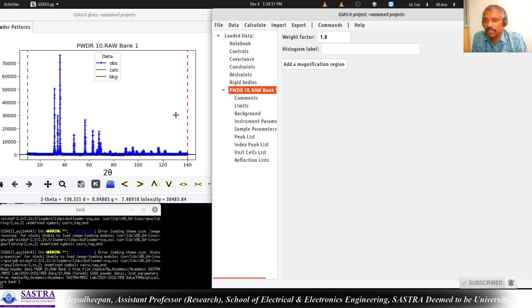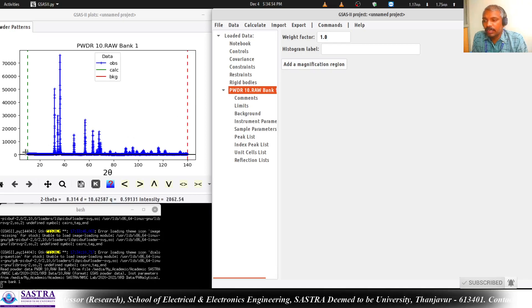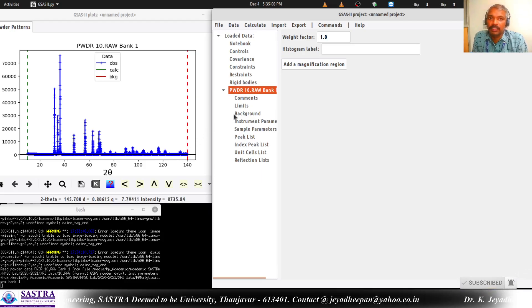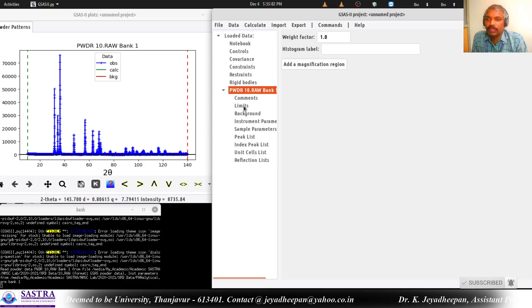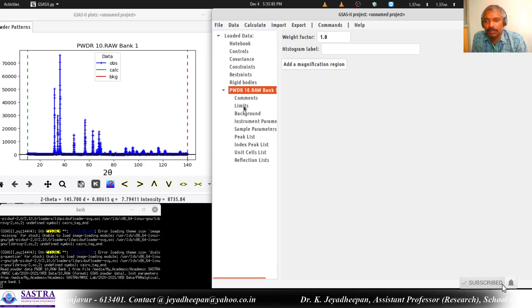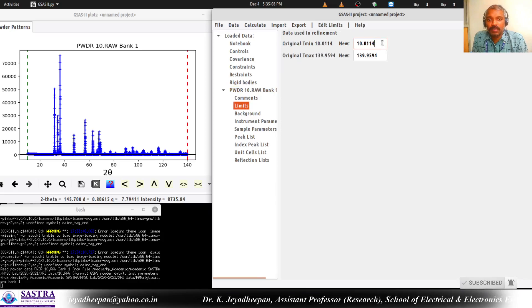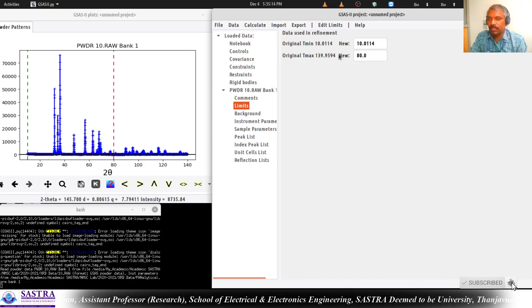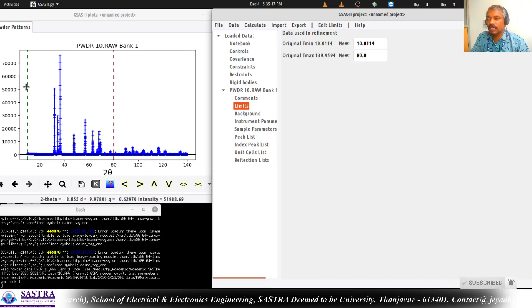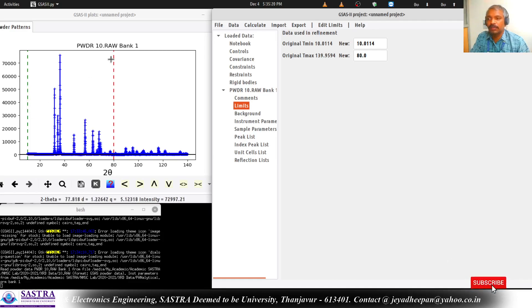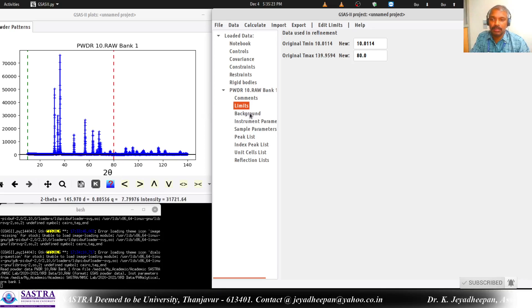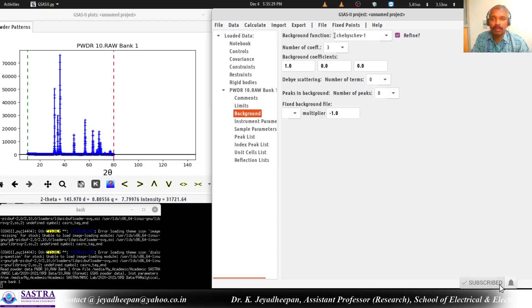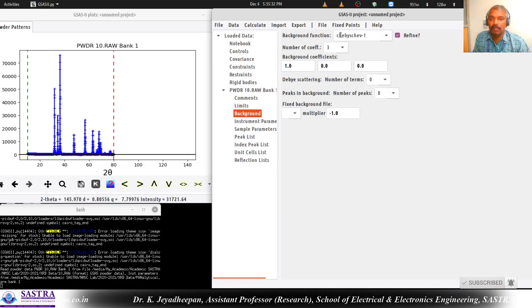Since it is a semi-quantitative phase analysis, I do not need to use the data from 10 degrees to 140 degrees of 2-theta. I can limit the data to 80 degrees or 90 degrees, which is required for semi-quantitative phase analysis. For that you just go to Limits and set from 10 degrees to maybe 80 degrees of 2-theta. Now the data is selected from the dotted green line to the dotted red line. Now you just go to the Background tab.